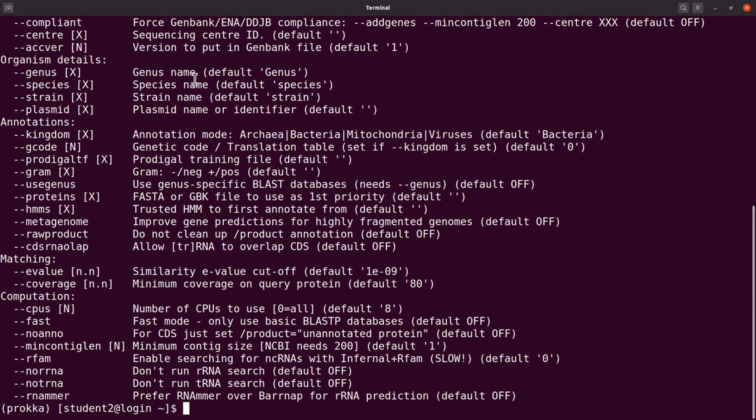So just get the explanations from this text or from the GitHub page and then try and modify them to suit your needs. So let me clear the screen first.